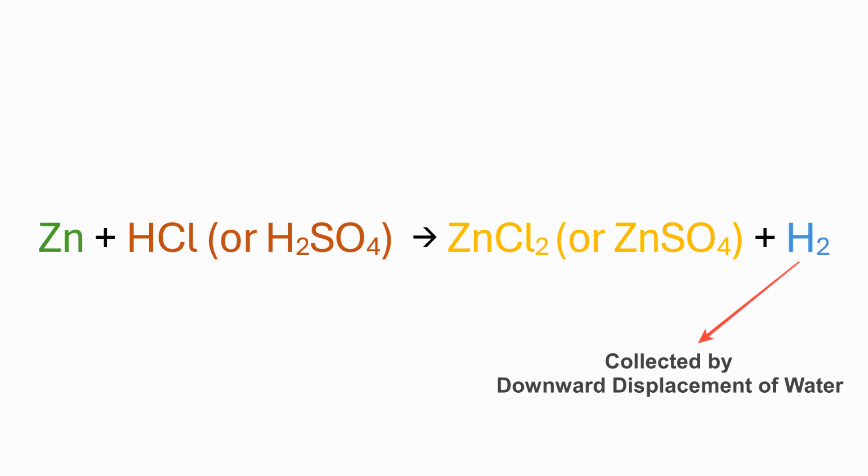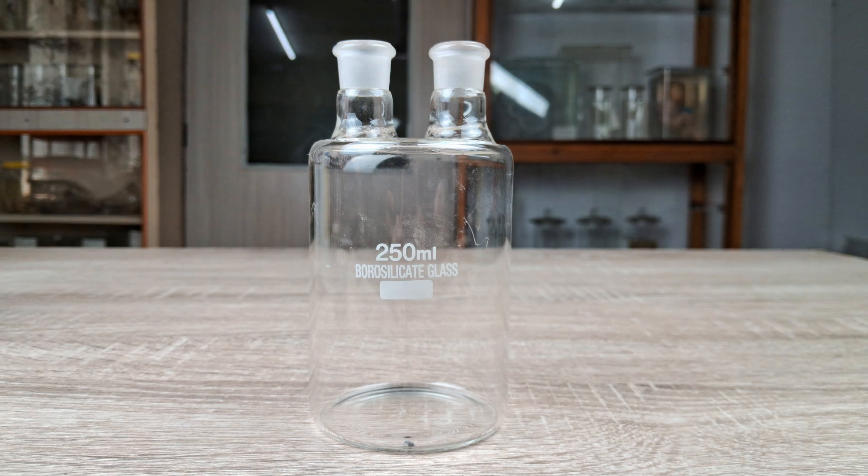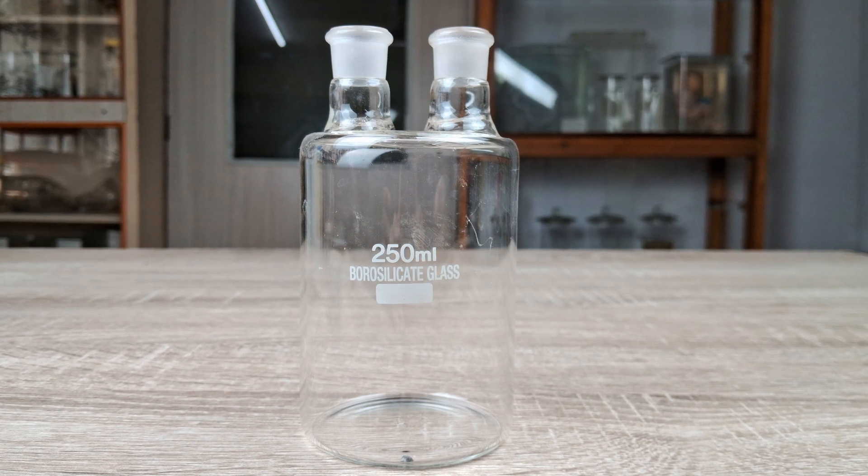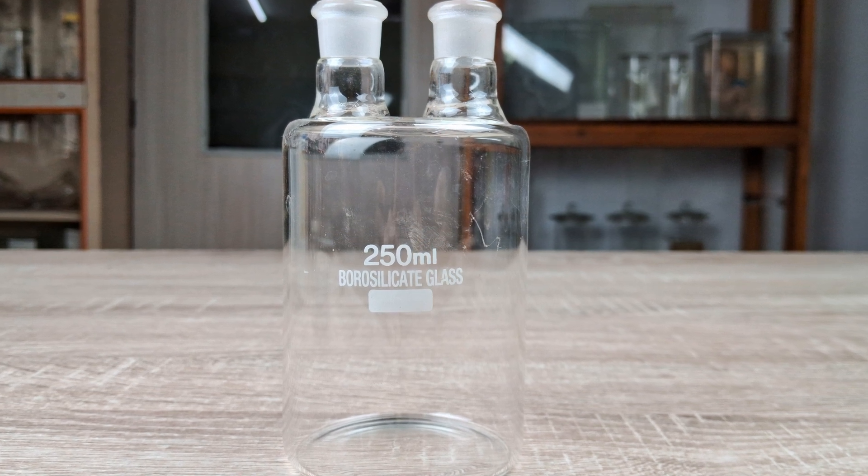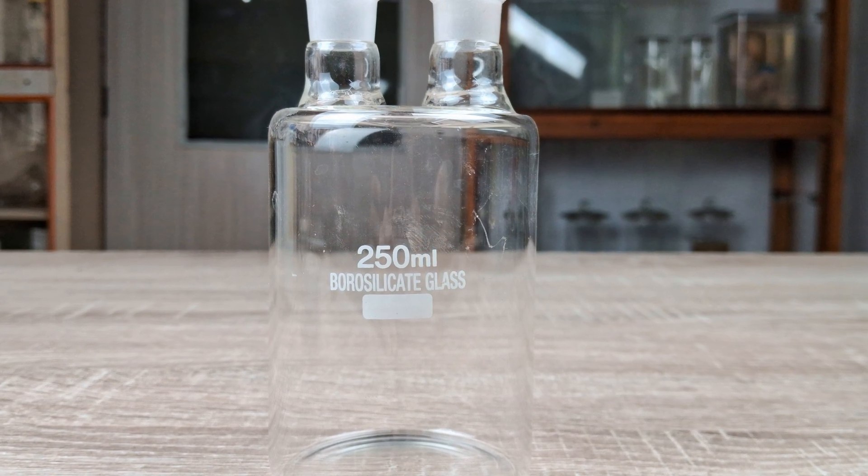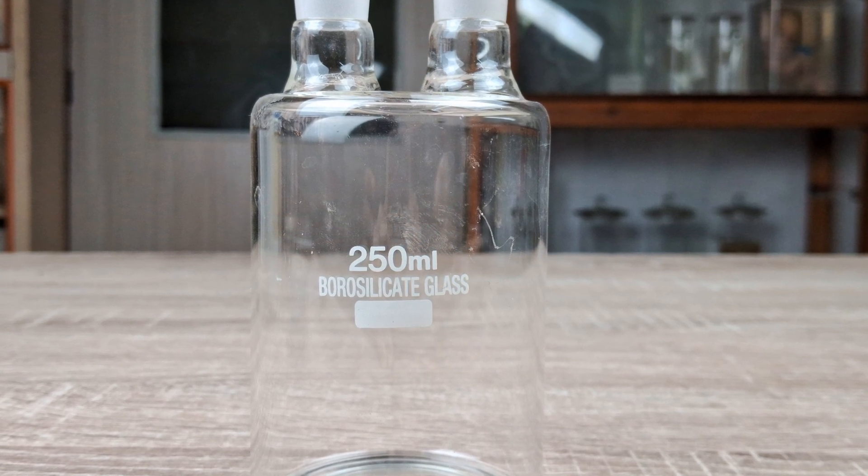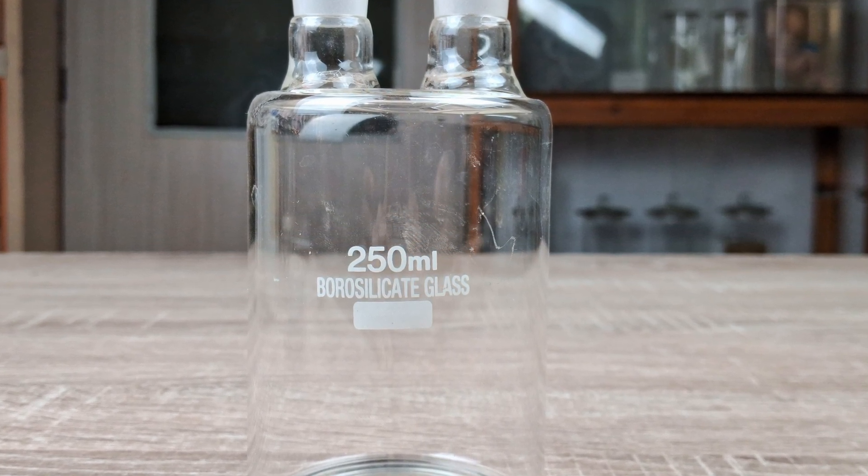To perform this experiment, you'll need the following: a Wolf bottle or a 250 mL round bottom flask or a 250 mL Erlenmeyer flask. For this experiment, I'll be using a Wolf bottle, which is the most common glassware depicted in textbook diagrams for the reaction of zinc with an acid.